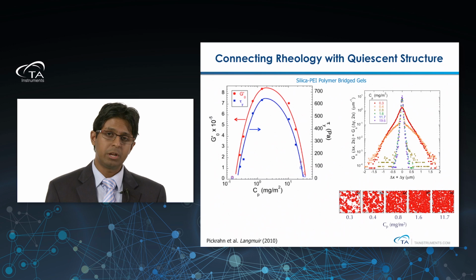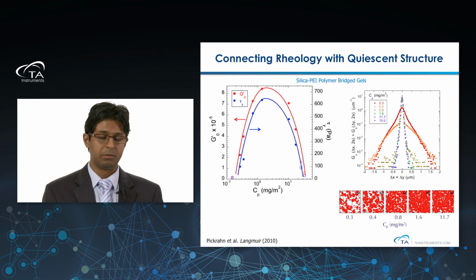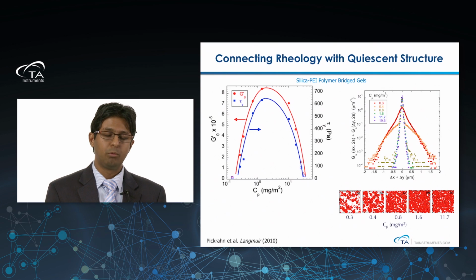After we go through a critical concentration, through the peak in the rheology plot, we don't see any changes in the dynamic behavior, meaning all the particles are still arrested. We don't see them become mobile again. The snapshots on the bottom show 3D renderings of the sample structure of just the arrested particles alone.